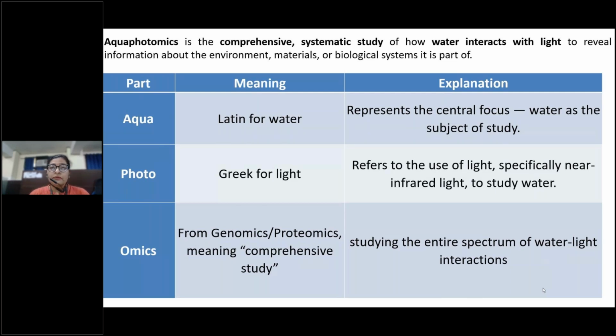Photo means light. Here, especially, we use near infrared light. We study that when light interacts with matter, and the matter can be anything, how does that matter respond to the incident light? And we study the patterns in water.